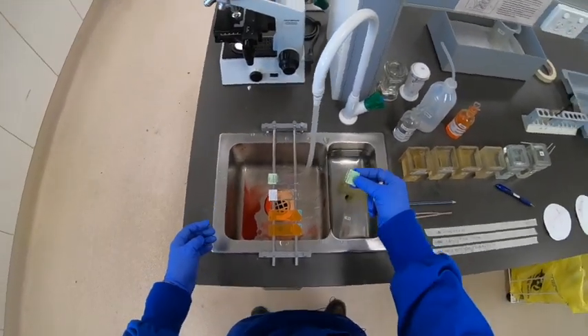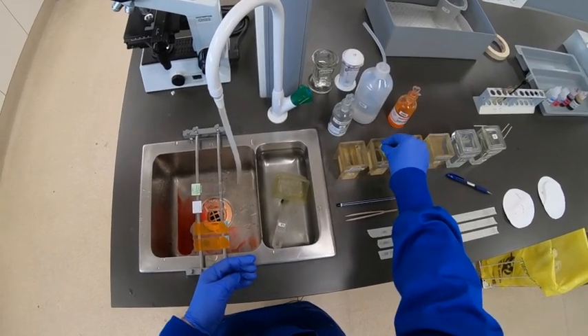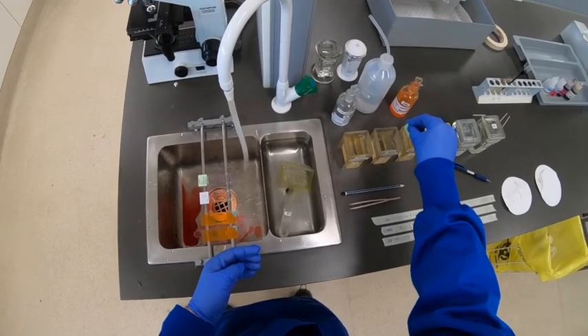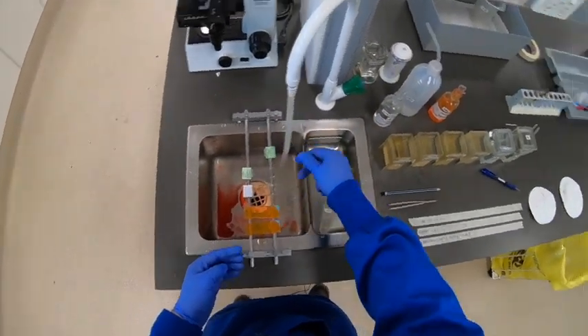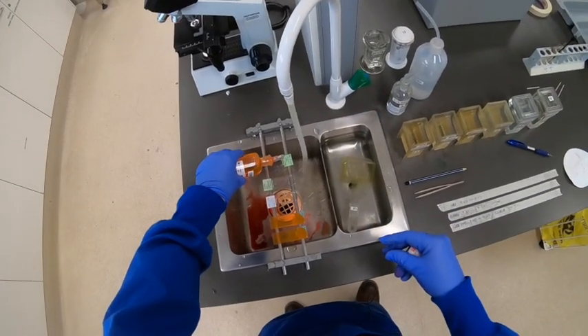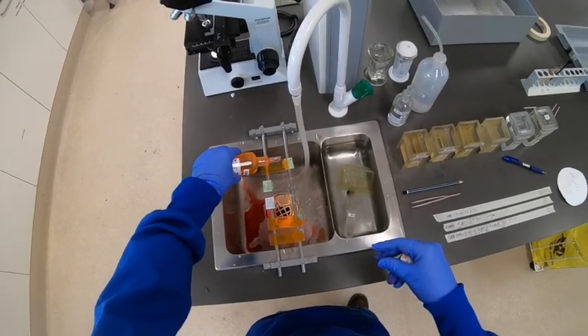As you can see, you can do multiple stains at the one time, but you do have to be careful not to contaminate your slides. I probably should have moved those other two slides down a little bit, but as long as you're careful everything should be okay. And then finally, just applying the eosin to the last slide.